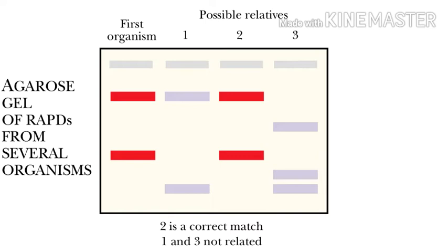The result is a diagnostic pattern of bands that will vary in different organisms, depending on how closely they are related. Although we do not know in which particular genes the PCR bands originate, this does not matter in measuring relatedness. Diagnosis therefore relies on having a primer, or set of primers, that reliably give a band of a particular size with the target organism and give different bands with other organisms, even those closely related. RAPD results using such a primer are shown in the figure.